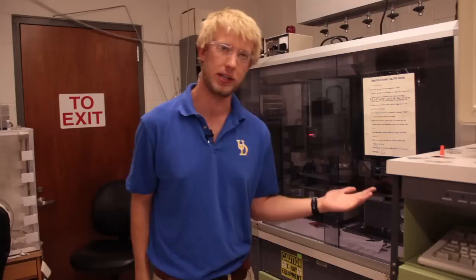It tells us things like if there's PCBM, which is a small molecule, if it goes in between our polymers and changes that spacing. We can learn a lot of information from this XRD machine.